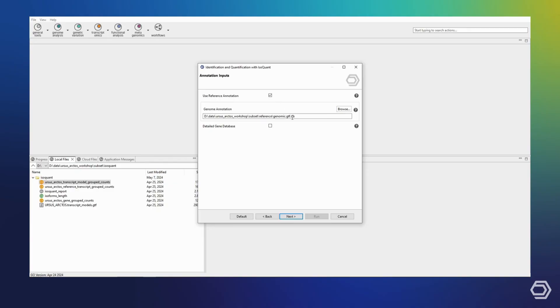You could also provide a usual GTF file here, but IsoQuant internally uses a gffutils database. And by directly supplying this database format here, we can save some time as well as computational resources.